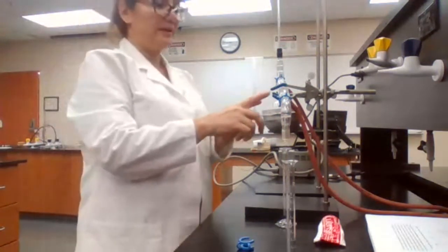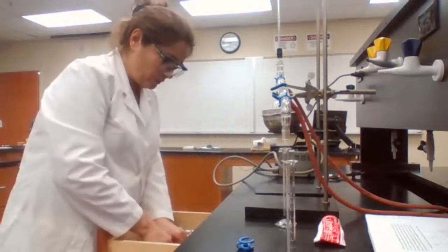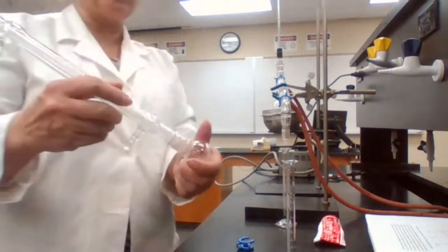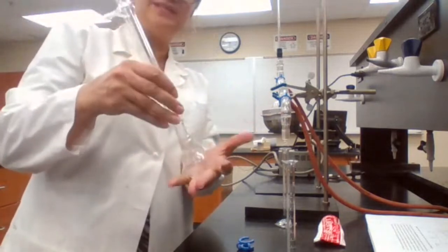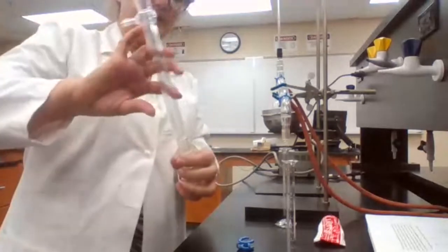The other reason is that glass has a low melting point. So if you don't grease these glass joints and you start heating with high heat, these two pieces can fuse together.